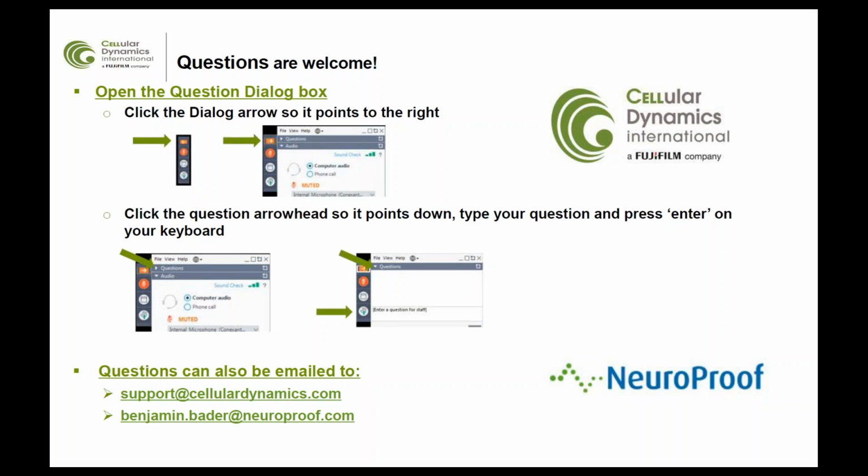Kevin, you have stumped me. So network velocity comes out of one endpoint from the suite of endpoints that Axion provides in their neurometric tool. Again, I believe it is a measurement of how robust that network activity is. So whether or not you've got a few electrodes in synchrony, or whether you've got a strong, high level of synchrony across the well.